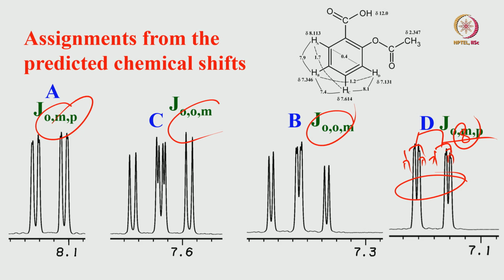That is easy, but only in the case of the phenyl group we have to be a little careful, because we have 3 different couplings, ortho, meta and para. Depending upon the substituent, whether it is symmetric or asymmetric, ortho, meta or para disubstituted, we have different multiplicity patterns for different protons, and we understood how to do that.